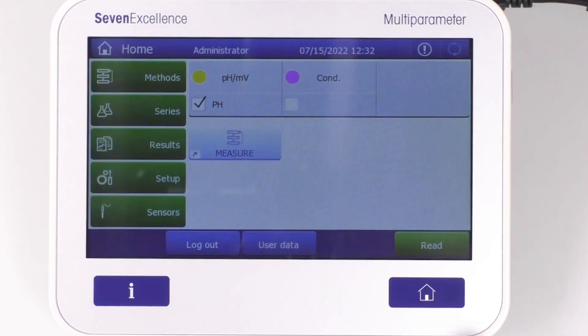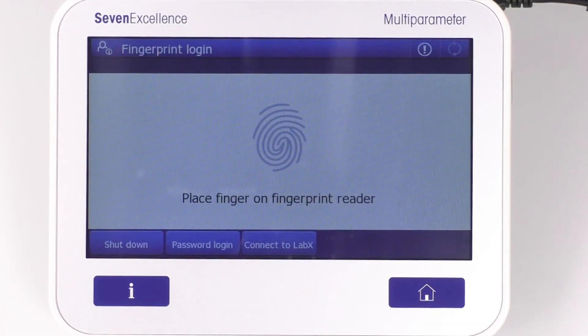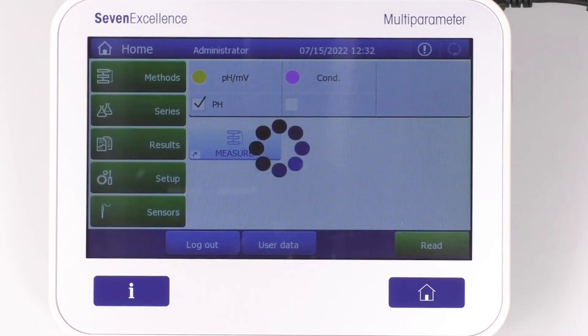Once you have completed the registration successfully, you will be notified by a pop-up. Now, when you log out from the meter, the login screen shows a message asking you to place your finger on the fingerprint reader. We hope we've provided you with some valuable information.